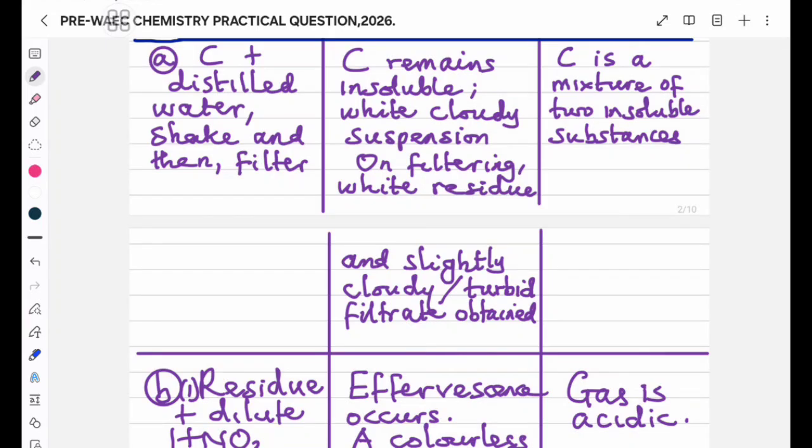Very tiny particles of starch pass through the filter paper with the water, making the filtrate that is collected not as colorless as water one would have expected, but cloudy in nature. The particles are too small to be completely trapped on the filter paper.